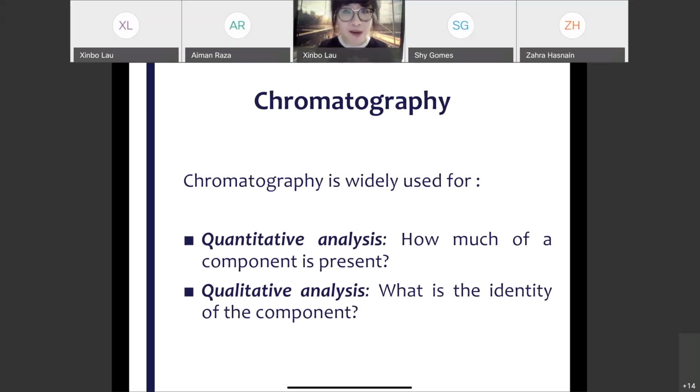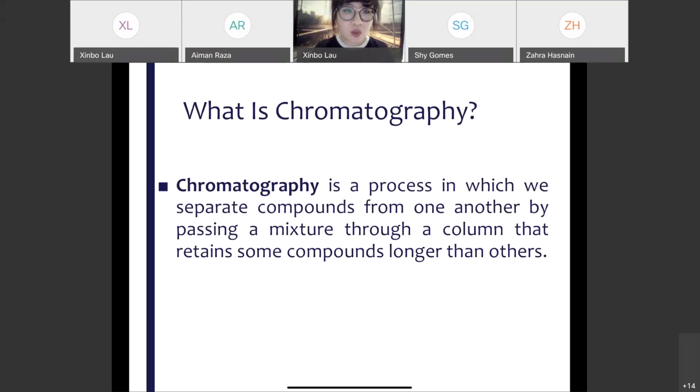As we talked about in work, right? Like IR, you can use that to study the functional groups, but you will not just use IR to identify what that is. That's just in terms of qualitative. For chromatography, we can actually use instruments to identify what compound we have, the component in that mixture. So that's quite useful, and you can use it for whatever purpose you have for using the instruments.